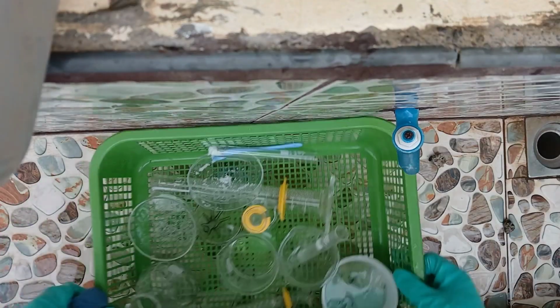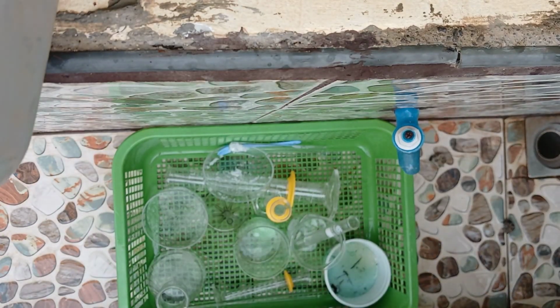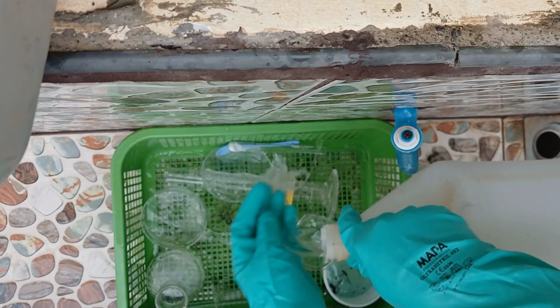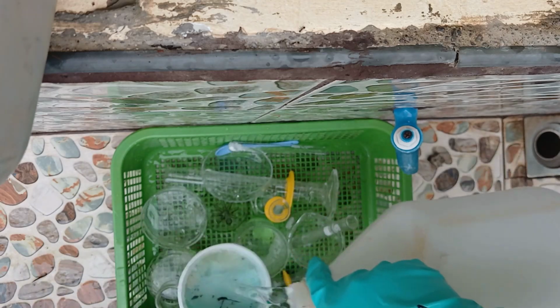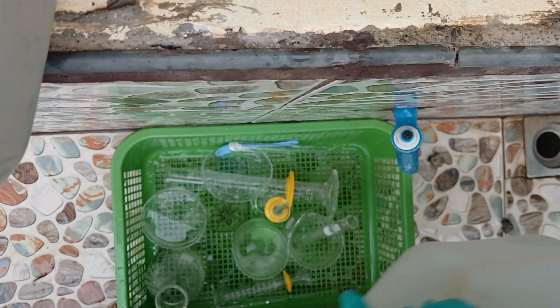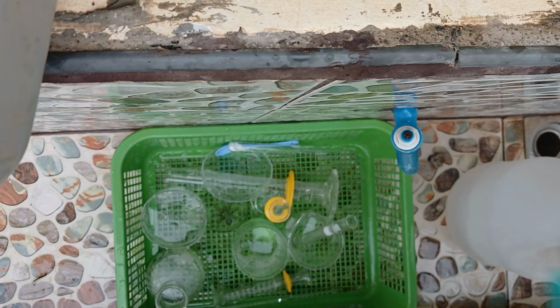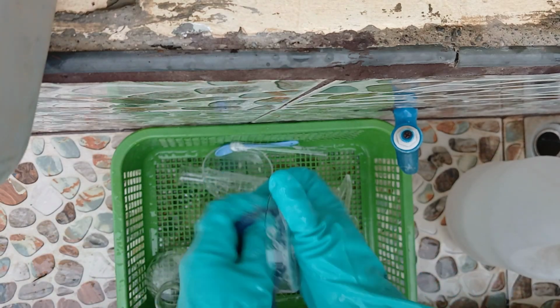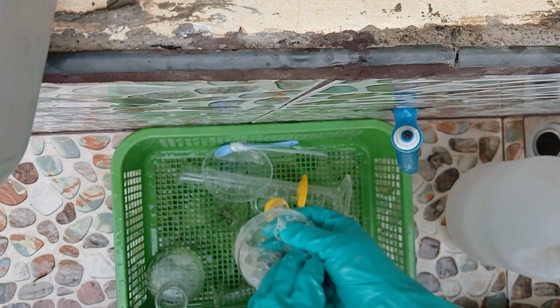Okay. And of course, after doing laboratory work, it's part of your duty and job to clean your glassware after use, for the benefit of the next user. Or if you use it again, then it's already clean and it would be easy on your part.